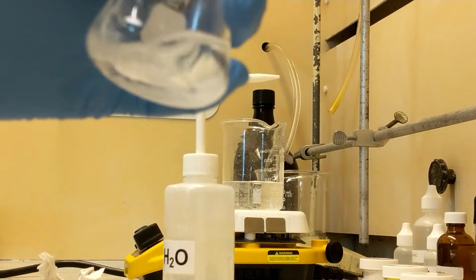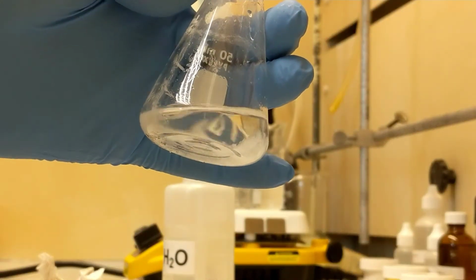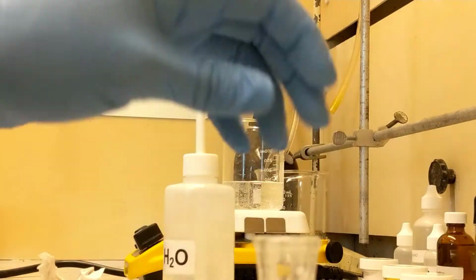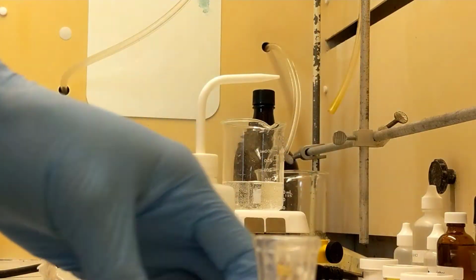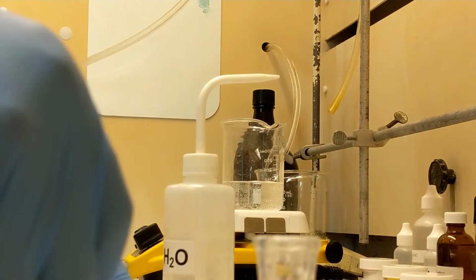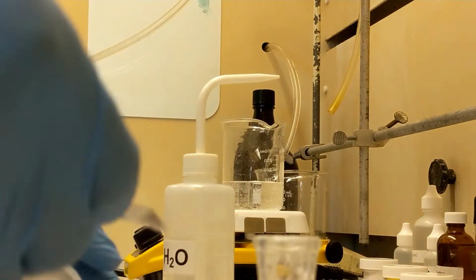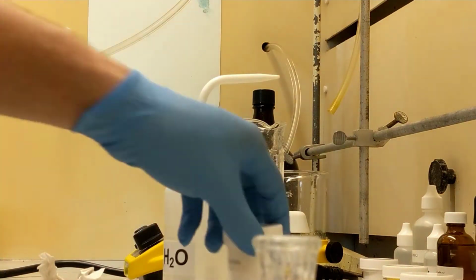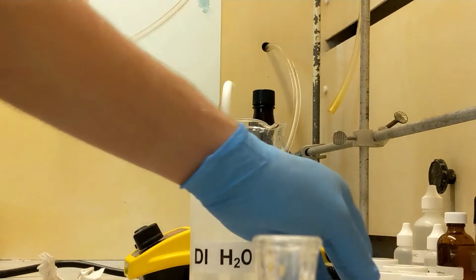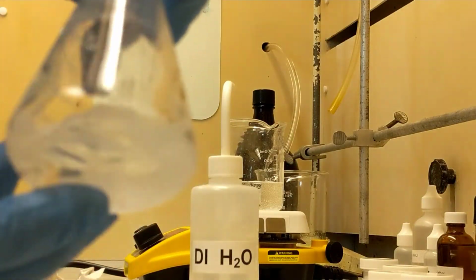So I think I'm gonna add one more spoon just to be sure, because I really don't want this wet at all. I really don't. And then I'll move it to try to extract just the caffeine. One more spoon. There we go. Trying to dry this liquid out.